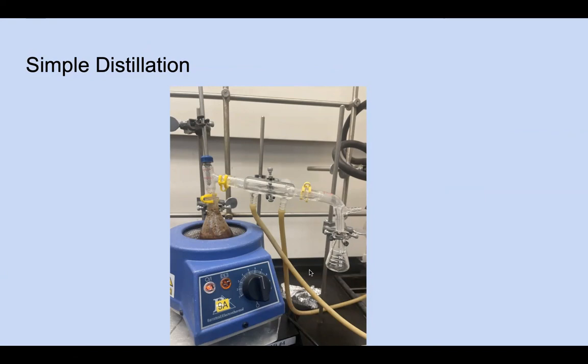When analyzing this, I realized that maybe it was the decrease in volume that allowed for my distillate to increase rapidly. What I mean by that is for fractional distillation, we had a tube right here, but now we don't. This allows for the vapor to just decrease in volume and spread faster.